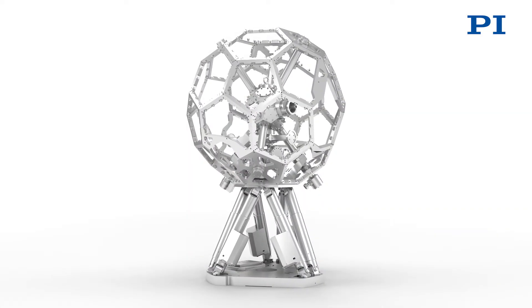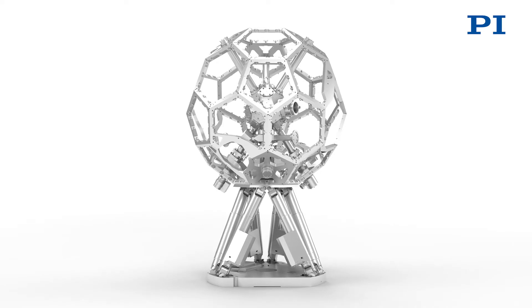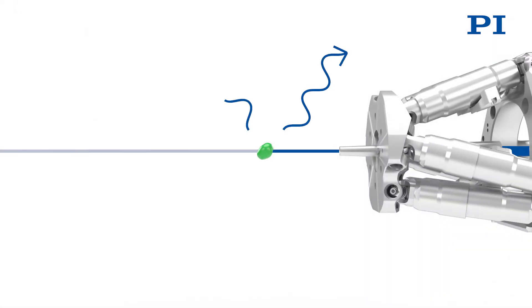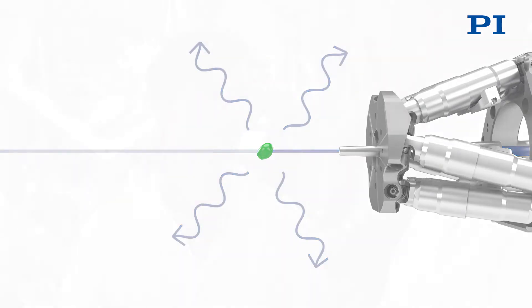How exactly does it work? The incident synchrotron or X-ray radiation is focused onto the sample by an X-ray lens. The sample in turn emits light in the X-ray range. The spectrometer examines the light according to wavelength and intensity. This enables us to find out more about the material composition of the sample.